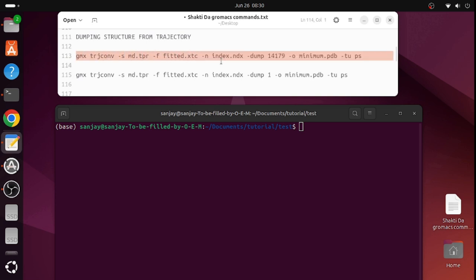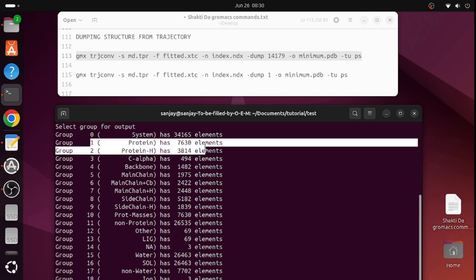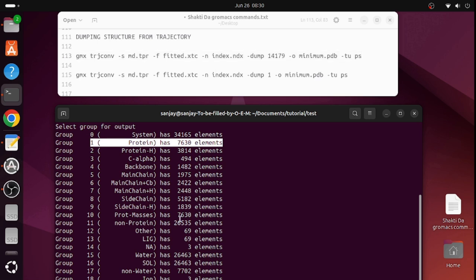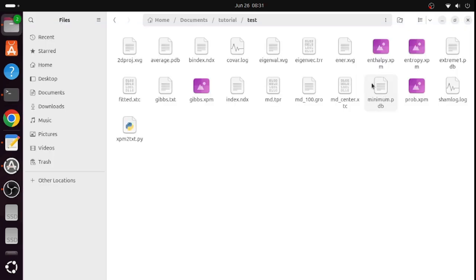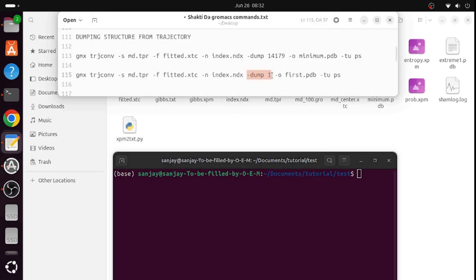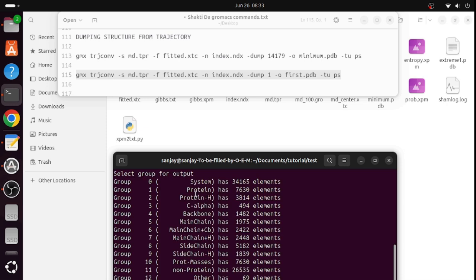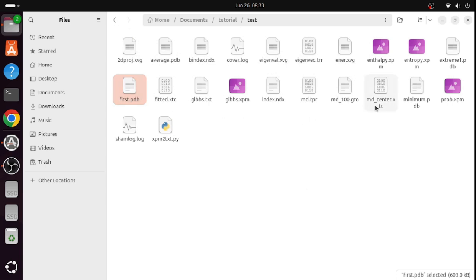Copy and paste this command into the terminal. When prompted to choose a group, since we are checking the structural alteration of the protein, select group 1 — protein — and the protein PDB structure will be saved as minimum.pdb. Now let's also extract the first structure, that means the initial structure at frame number 1, so that we can compare the structural alteration. Use the same command but specify the first frame, select group 1, and save it as first.pdb.